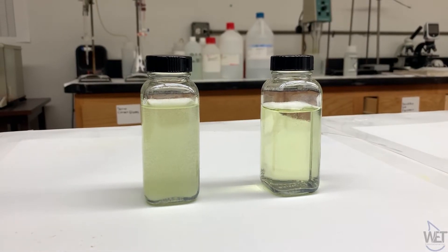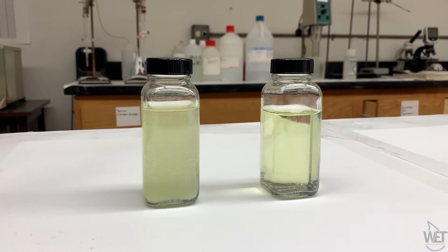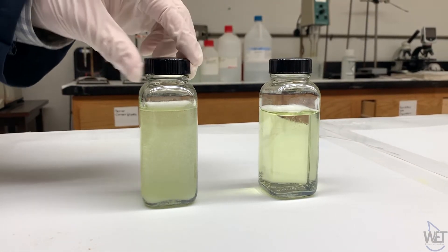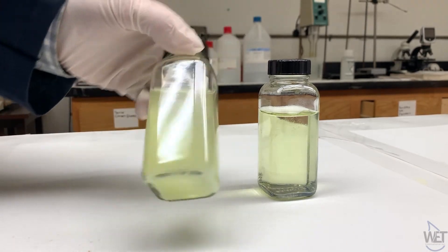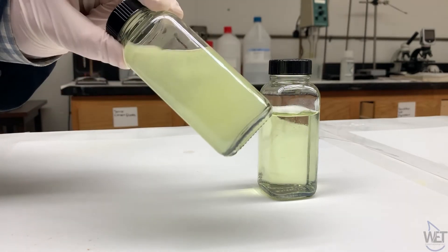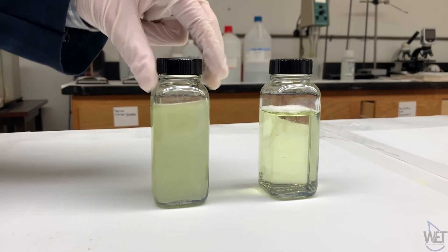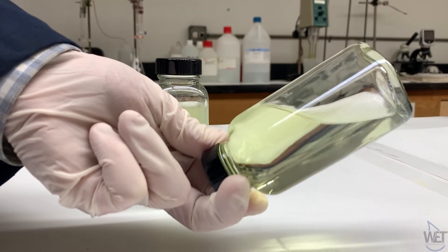After the 15 minutes are up, you can check the samples for the presence of a precipitate. In the tap water sample, as you can see, there is one that formed. And in the purified water, there is no presence of a precipitate.